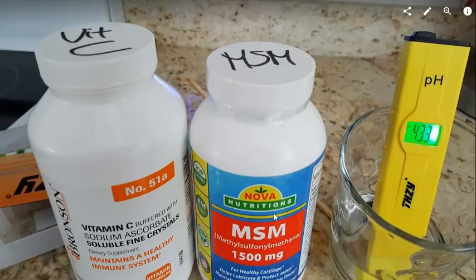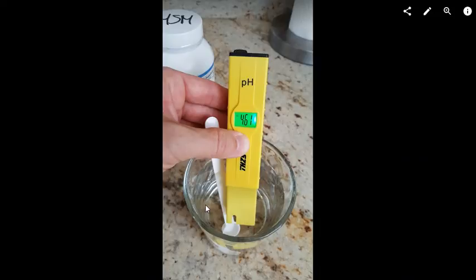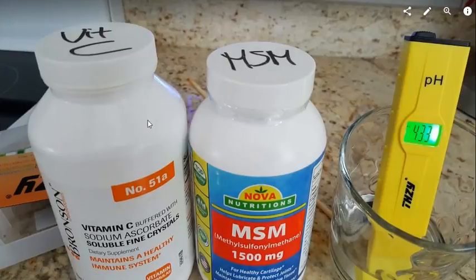I bought it because the MSM requires some vitamin C to have good absorbability and a powerful effect — like anti-inflammation and those things. I always had the impression that the pH value could be a little bit low.